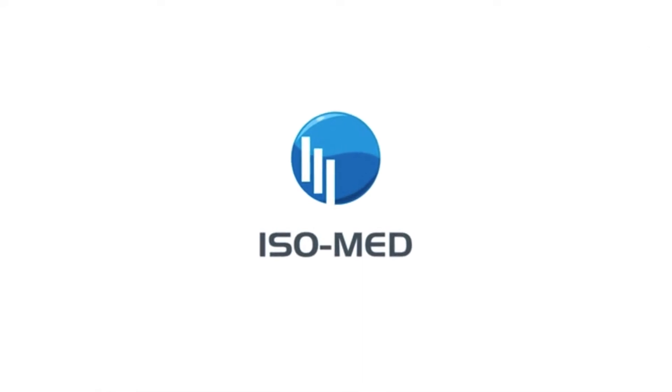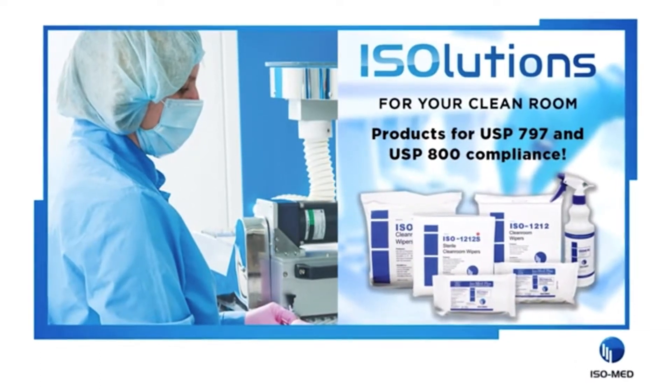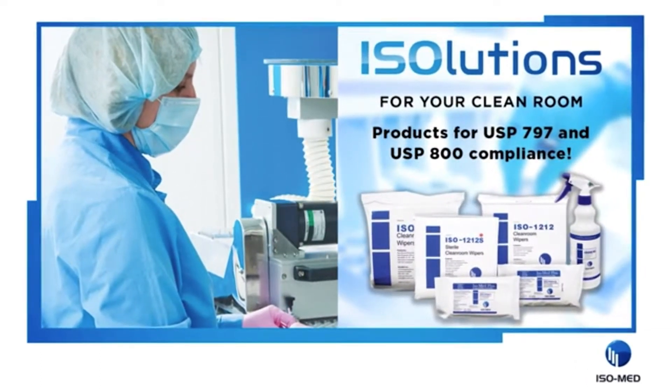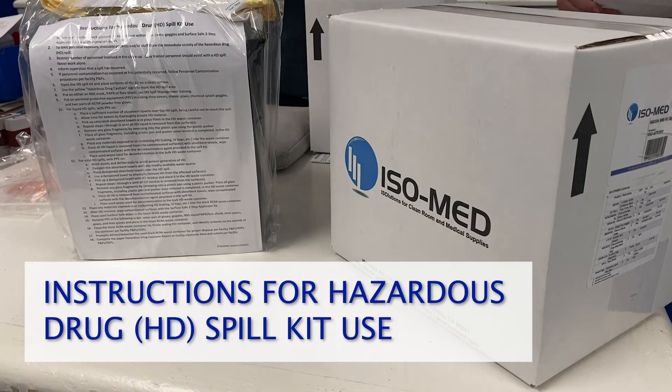isoMed solutions for your clean room products for USP 797 and USP 800 compliance. This is a demonstration of the hazardous chemo drug spill kit.